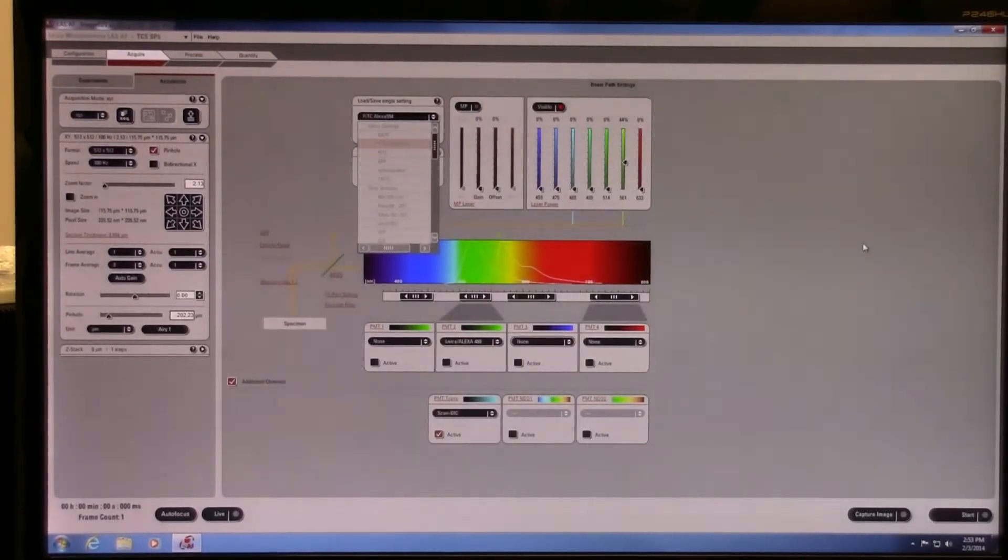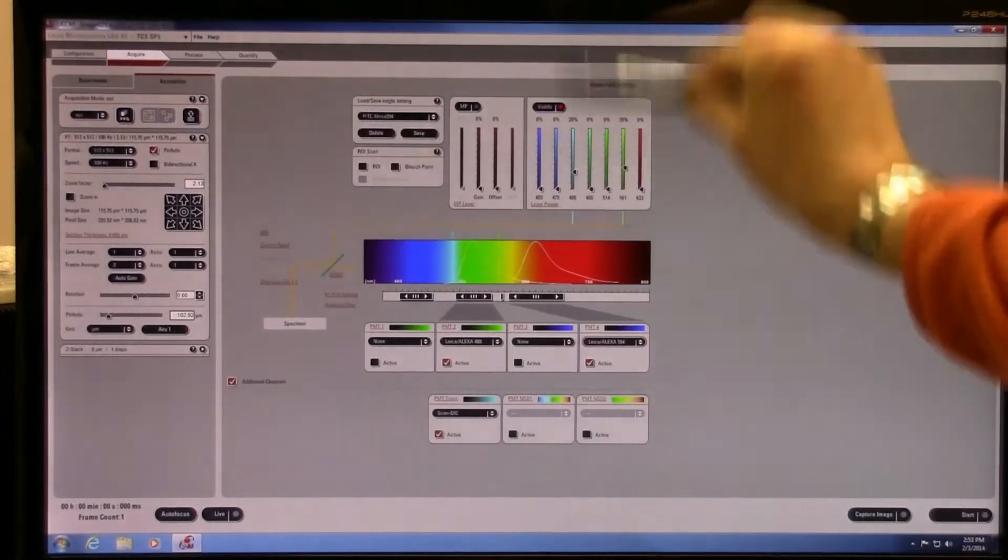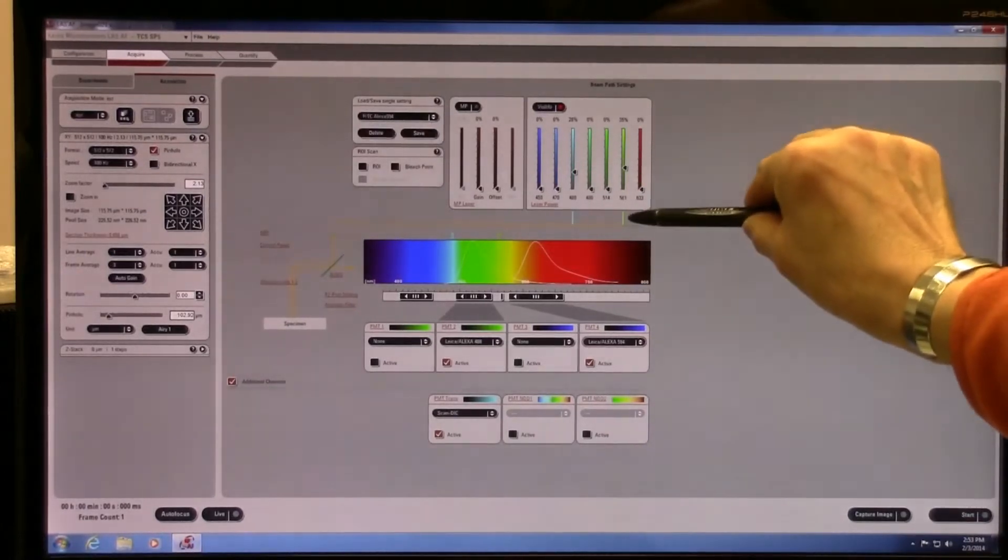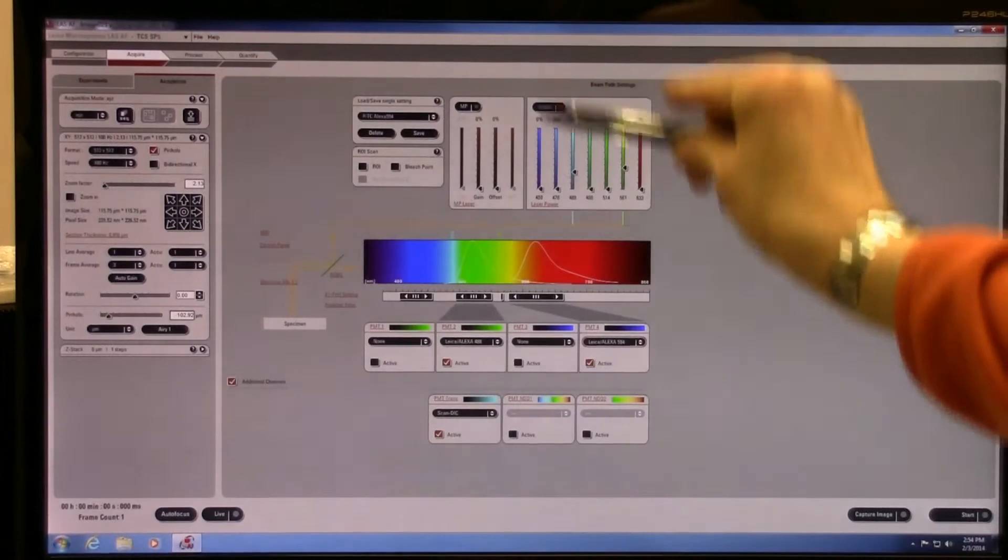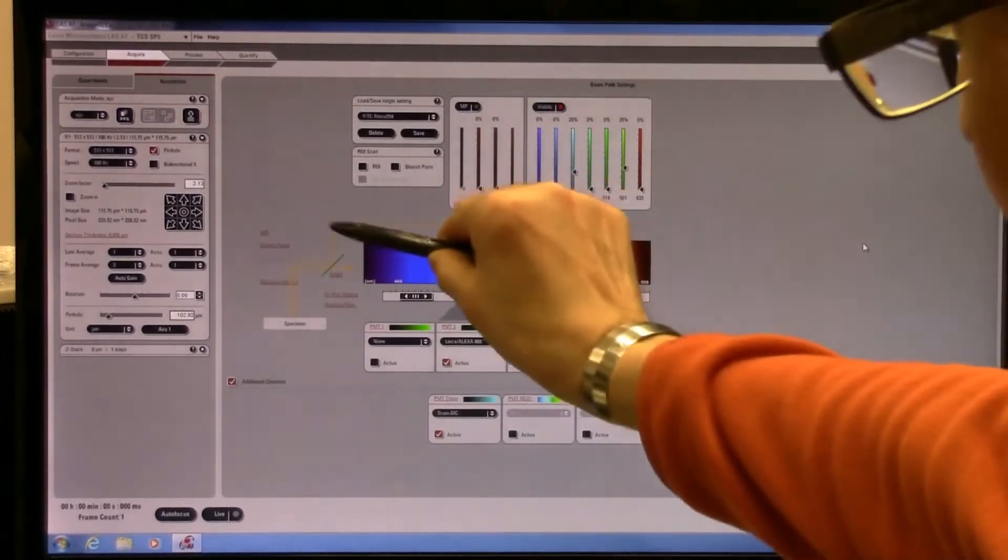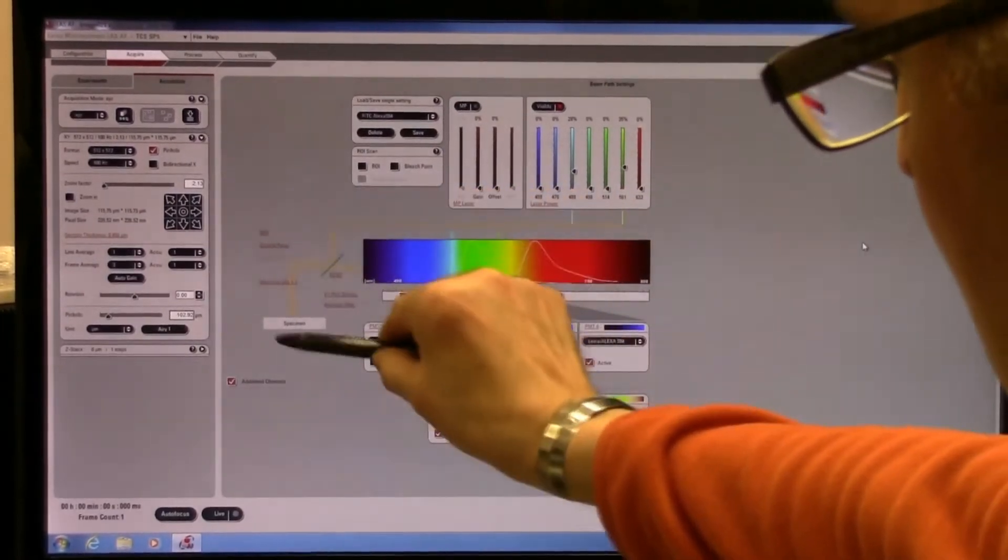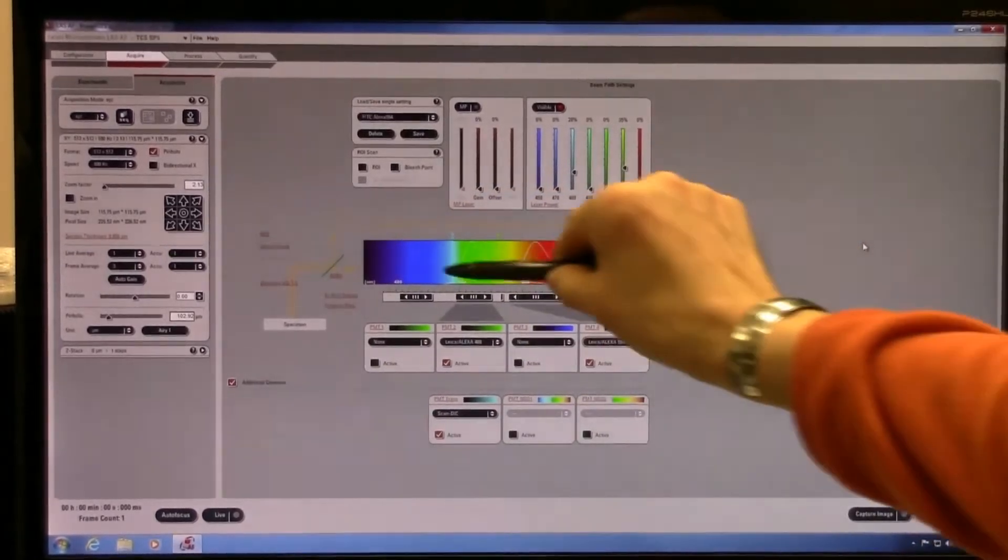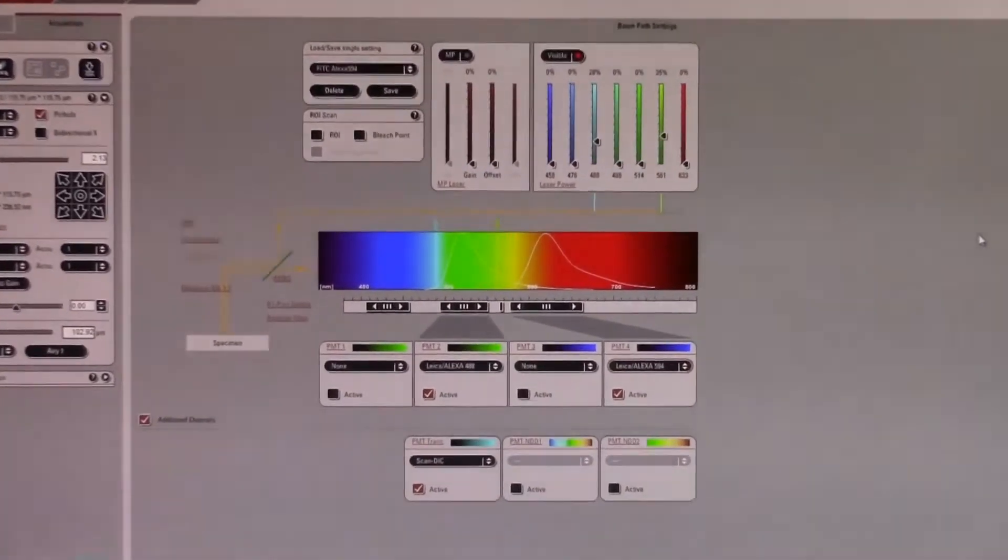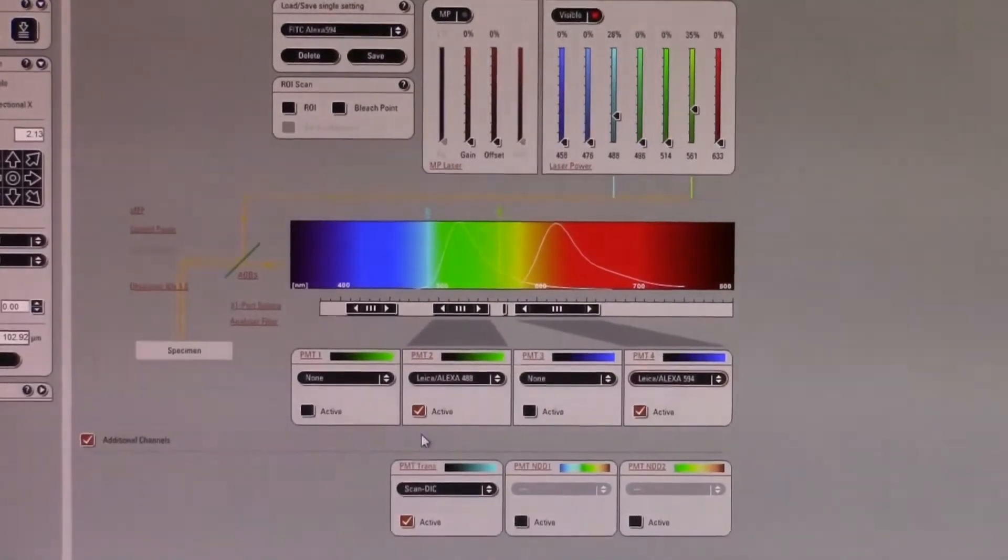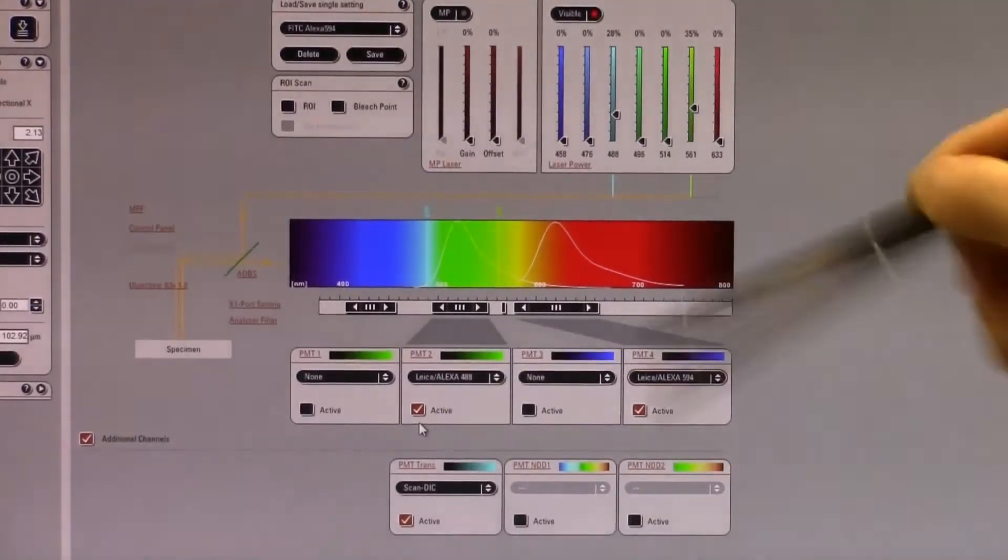What you're going to see now is that two lasers are being turned on: the 561 laser and the 488 laser. These go through the beam path across the AOBS to the specimen, and the fluorescent light is now going to be gated to two photon multiplier tubes. There's going to be two active PMTs.